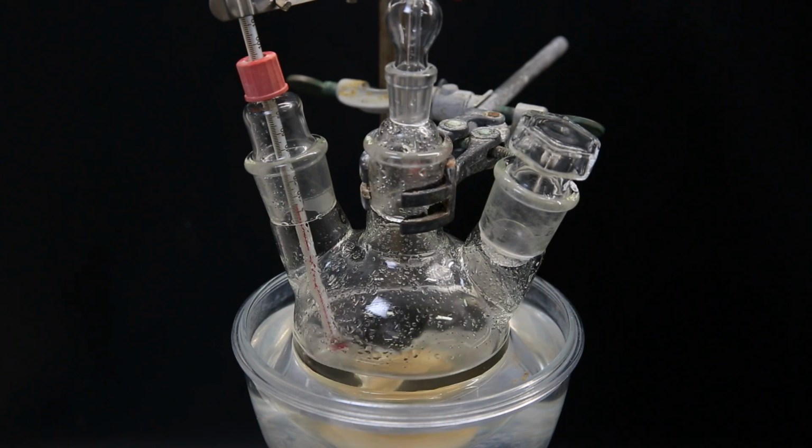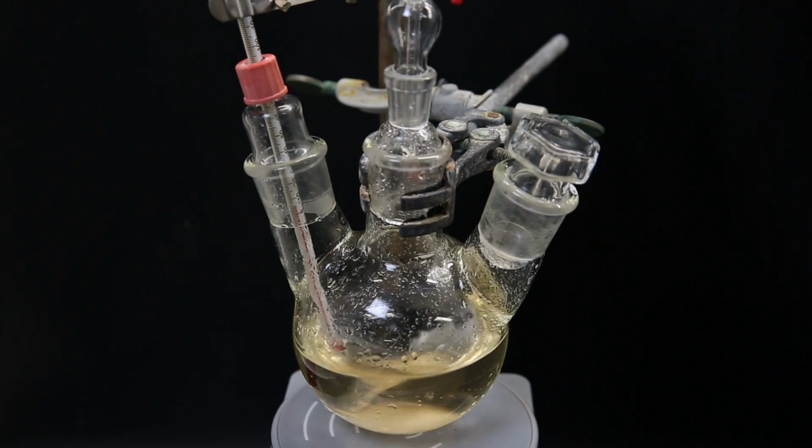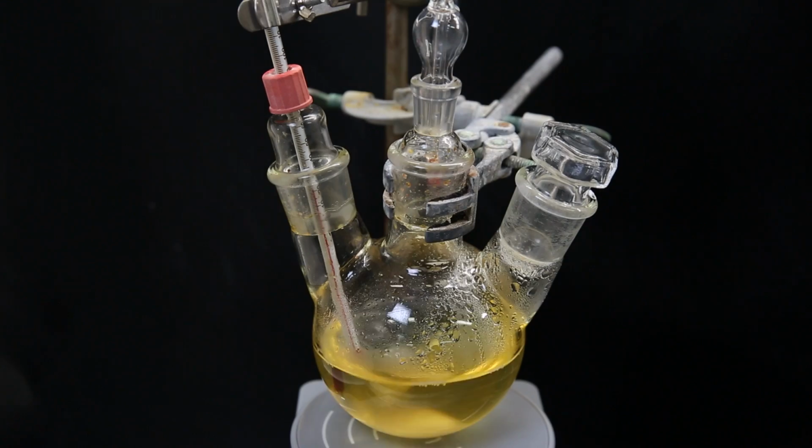When the addition is complete, it looks pretty much the same, and I remove the ice bath. I then leave the mixture to stir at room temperature for a day to allow the reaction to complete. When that is done, the mixture has turned a deep yellow, and I continue with the next step.